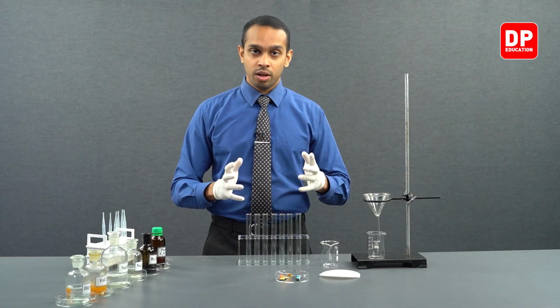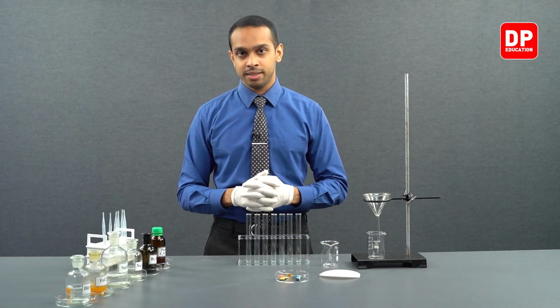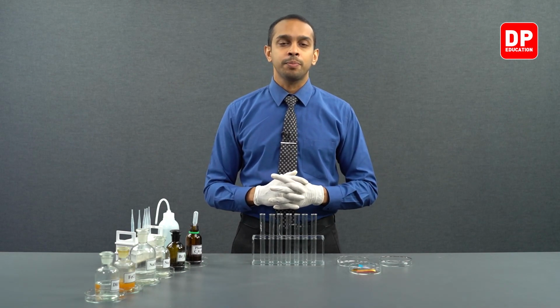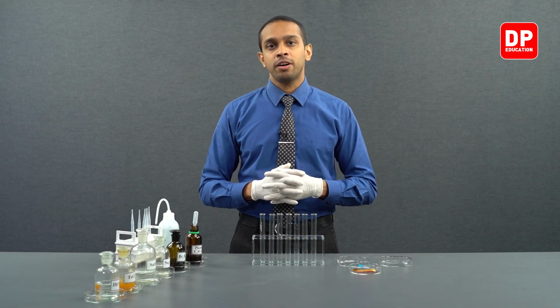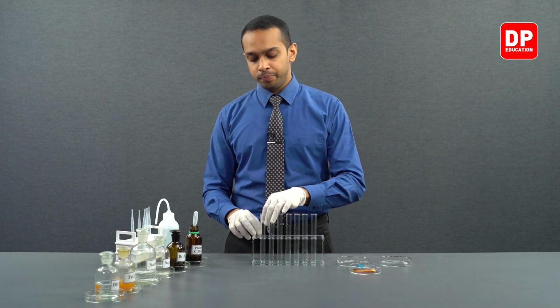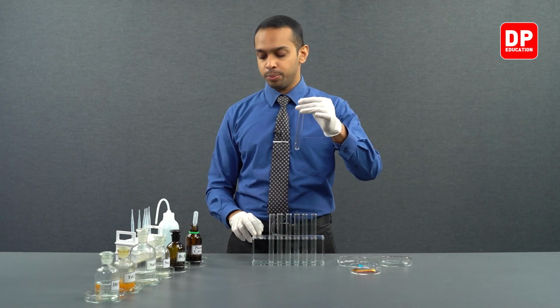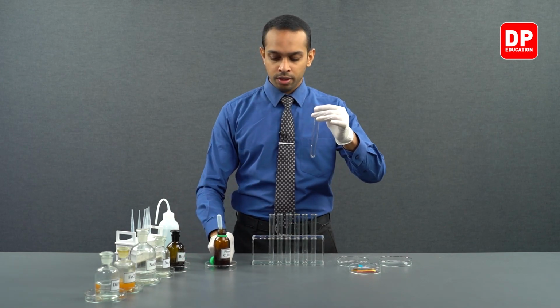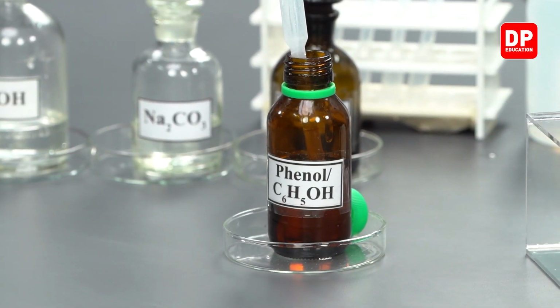Now, let's move on to the first part of this experiment. We are going to observe the solubility of phenol in water, and then we will be testing the pH value of a phenol solution. We will be taking a test tube, and let's take a small amount of phenol into our test tube.